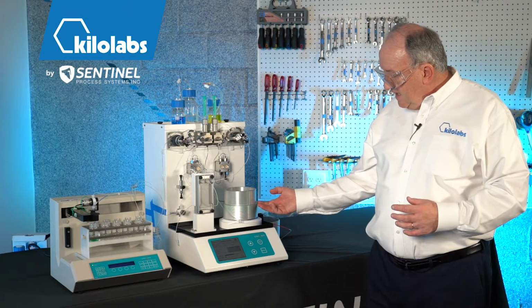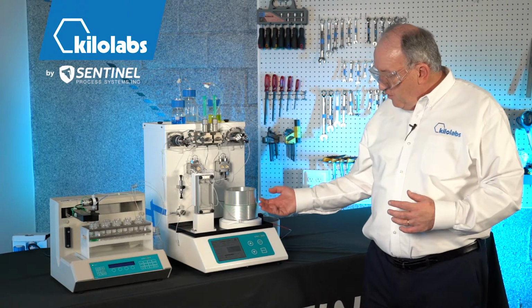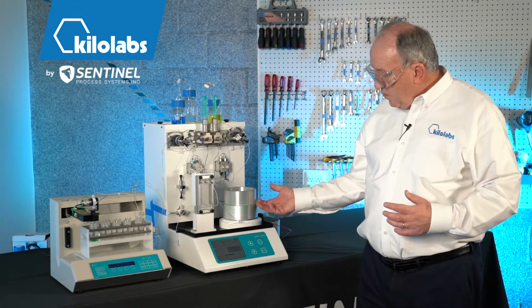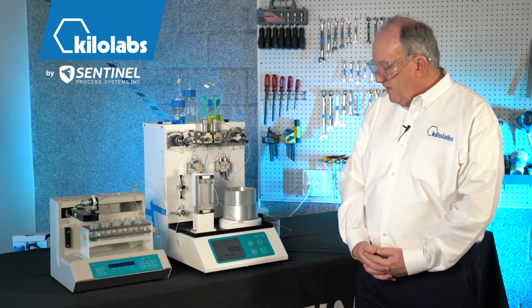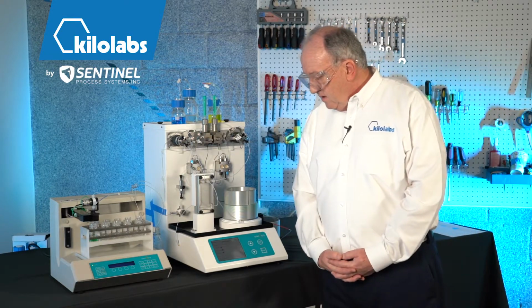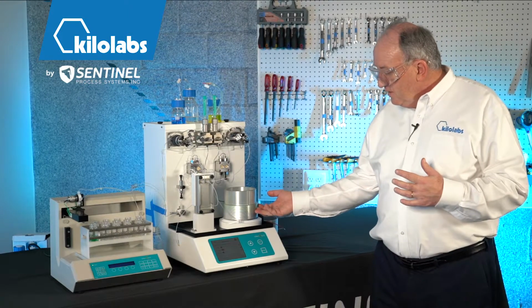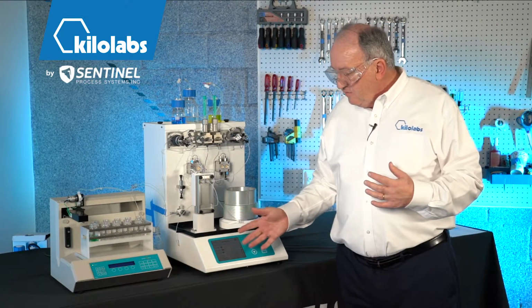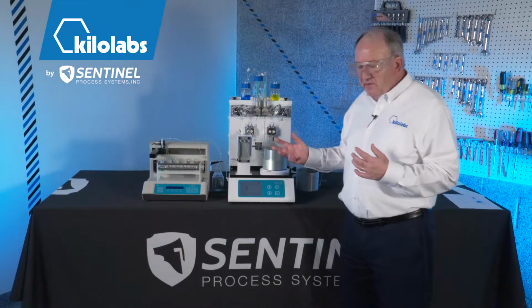And you can see this is the end of the dispersion plug. So this is the 4 ml that have already come through. That's our hard cut, but this is still not quite clean here yet, and the wash will take care of that. You also have all the solvent behind at the bottom of the coil as well. It is completed. We're rinsing this out, and the system is equilibrating and getting ready to run the third reaction, which is, again, at a higher temperature.